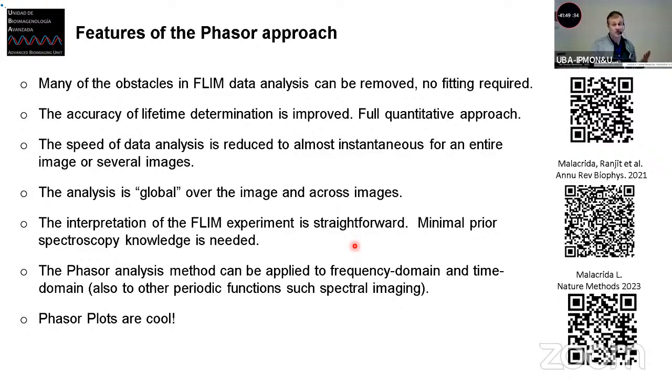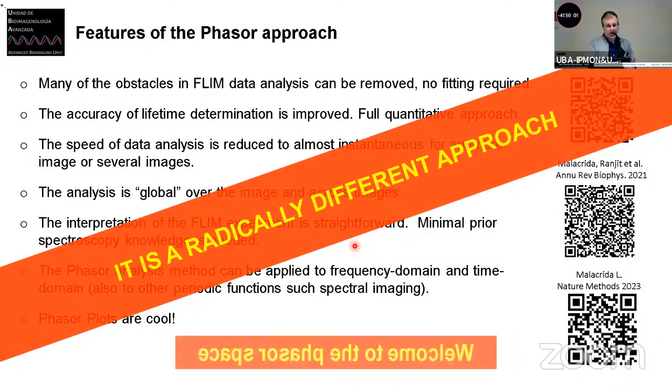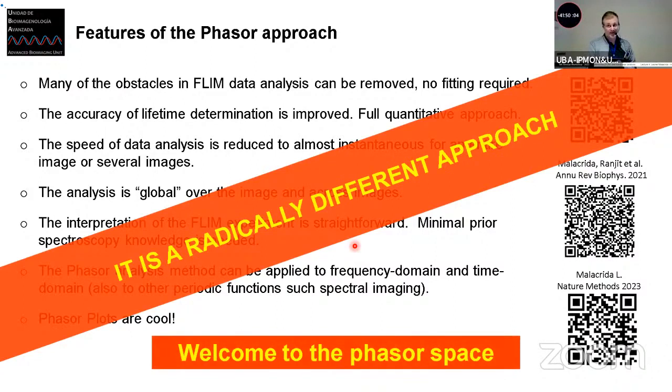The interpretation is really quite straightforward. My talk was very easy to follow because there's no really big requirement. You need to learn two or three new words to understand how the phasor works, and it does work in the time domain and in the frequency domain. So, as Enrico likes to say, the phasor is a radically different way to analyze lifetime, and I welcome all of you to the phasor space. Don't look back. When you jump into the phasor space, you cannot come back to the time domain anymore. It's not true, but anyway.